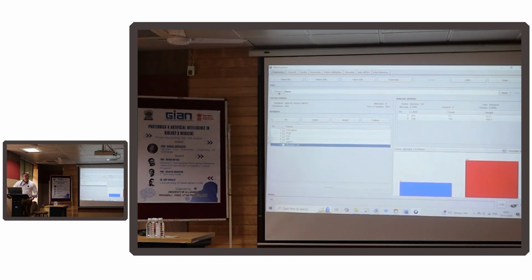I can choose filters for that. So I can use smoothing filters. Say we're using mass spec raw signal, you could smooth those signals out here with filters. So I can load those filters in. I'm not going to use them now, but there's lots of ways of filtering data in Weka. There's not time to go into those right now.